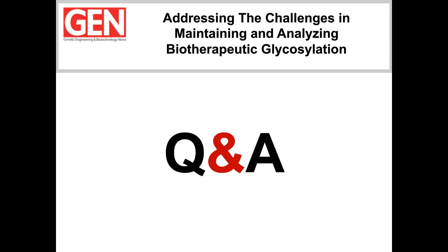And the first question is going to be for Shahir. The Glycan Assure looks great from an intra-assay perspective, but it is more important to understand inter-assay. How does the injection look on a multi-day test?